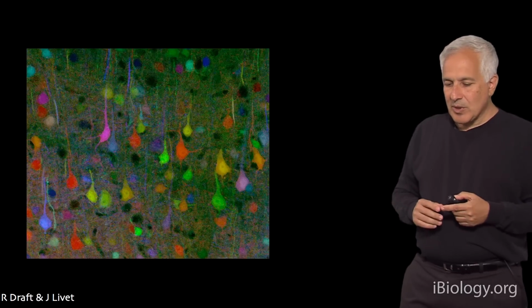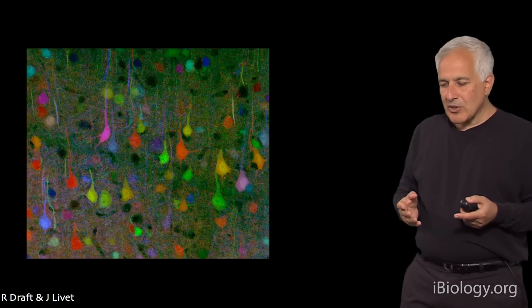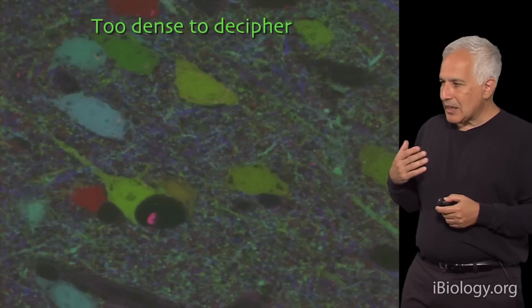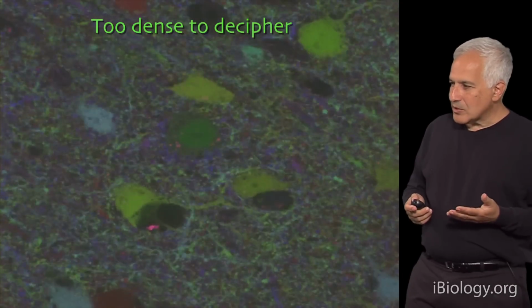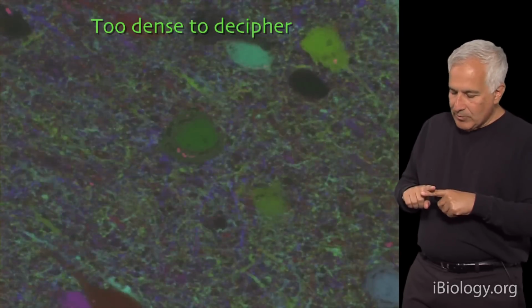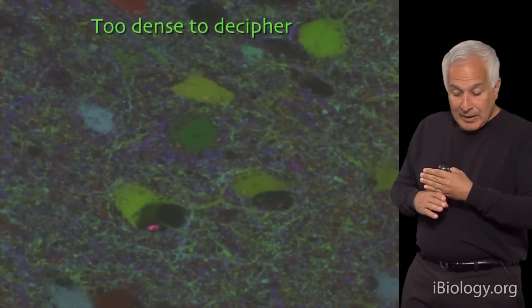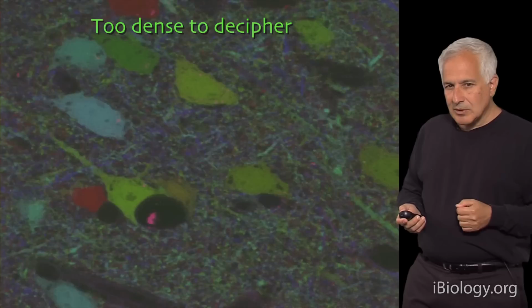And with at least the original generation Brainbows, when we tried to use the best optical imaging techniques we could at the highest resolution possible, that's Nyquist oversampling the data and using the highest numerical aperture lenses for the aficionados, if you view an area like that at high resolution, it's not surprisingly just way too many wires there. It's very hard to sort them out. And one of the reasons is that within a single optical section, the thinnest you can focus, there are often multiple wires superimposed on top of each other, and you have a hard time, especially if the colors are hard to discriminate, and there's only so many colors you get out of Brainbow, to know whether axons are crossing or just getting near each other and veering off. So the cell bodies are easy to see, but the wires are a little problematic.